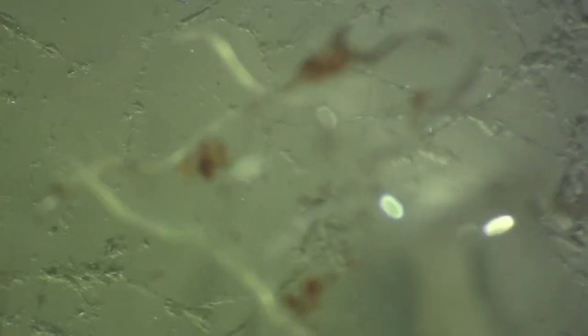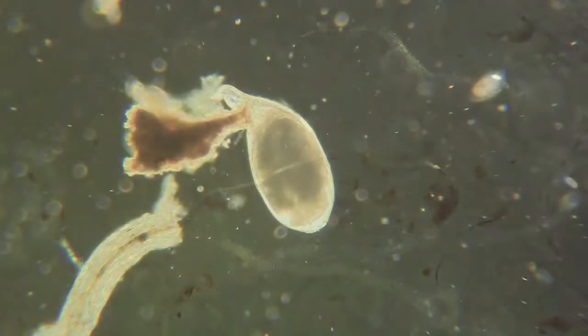We'll zoom in a little bit more so you can see it. It's not quite a mature female — it doesn't look like she has any eggs yet — but that's what we're looking for to confirm. The galls were caused by a nematode, and most likely a root-knot nematode. The other thing we want to make sure with this nematode is that we see a stylet. We always like to double check, so we'll move this over to a compound microscope.